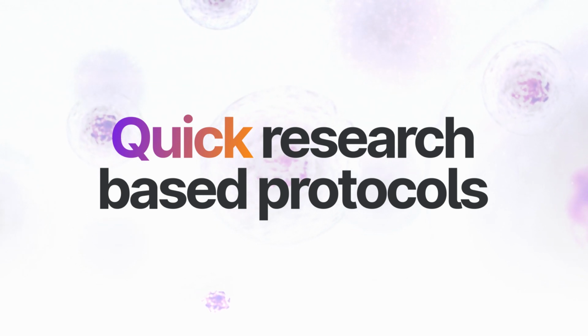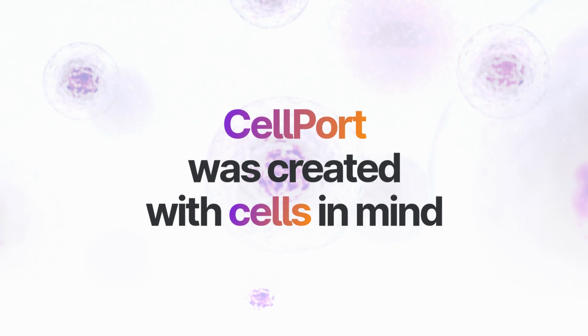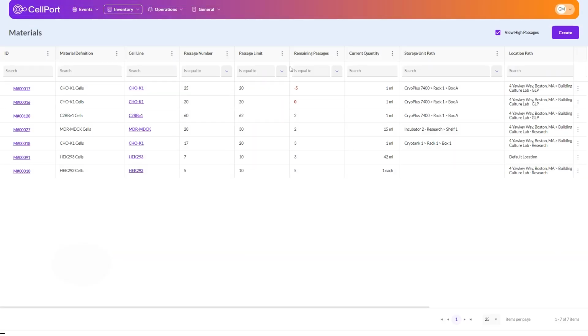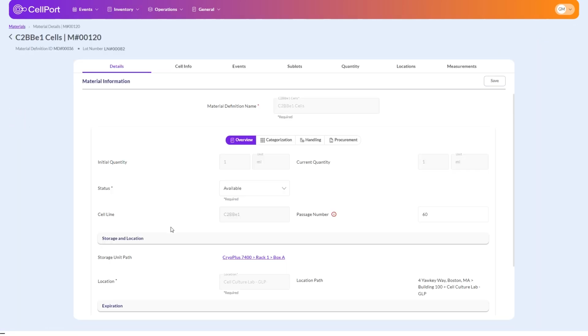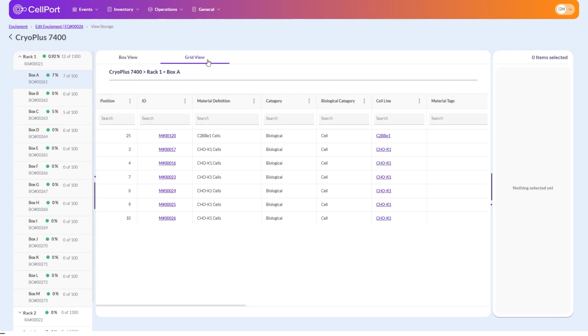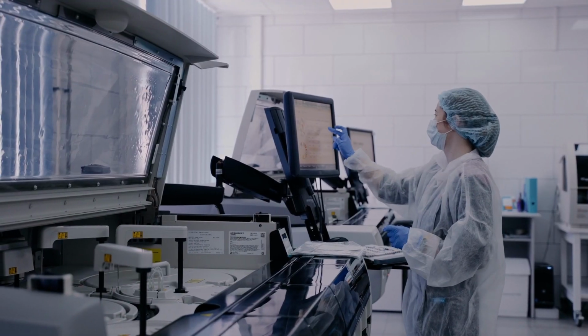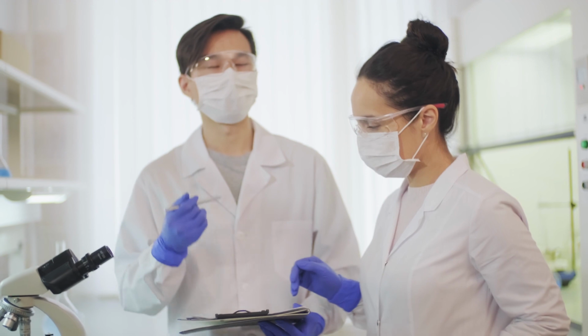CellPort was created with cells in mind, including the ability to set cell line-specific passaging limits with cell line-specific thresholds to alert you to cell flasks that may have been passaged too many times. The intuitive user interface in CellPort allows you to find the information that you need with 1 or 2 mouse clicks. Software for powering breakthroughs, built by our scientists for your scientists.